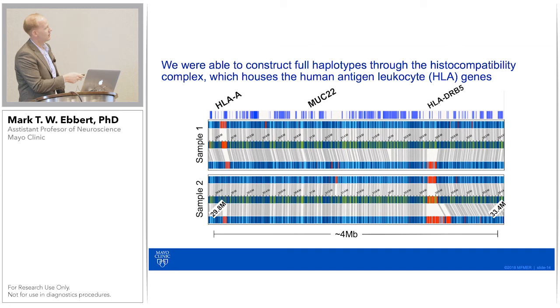And we did this across all 31 samples, as I mentioned, and you can see distinct haplotypes for most of the individuals. Most of them are at the HLA-A and the HLA-DRB5 regions, with a few others sometimes. So most of the genomic variability is in these regions, and you can see just based on the banding pattern, sequence that does not align anywhere to the reference genome, and that's just indicating variability, and it's different for most of the individuals, which you would expect.